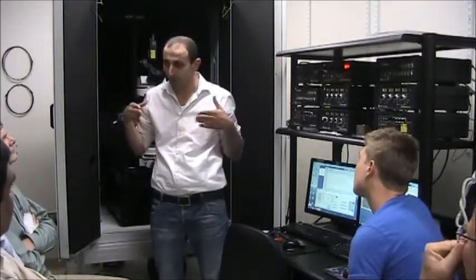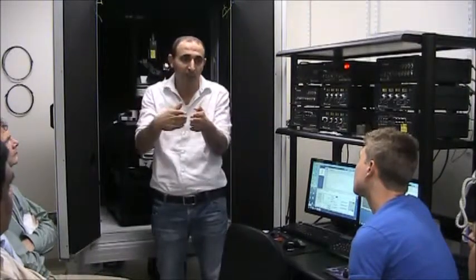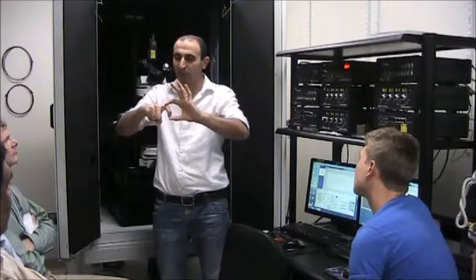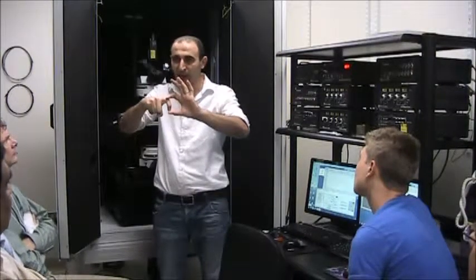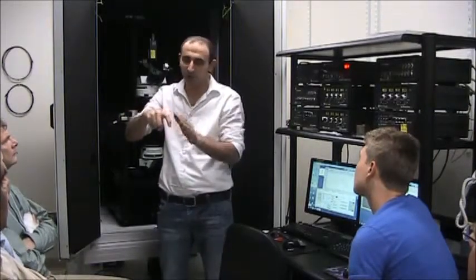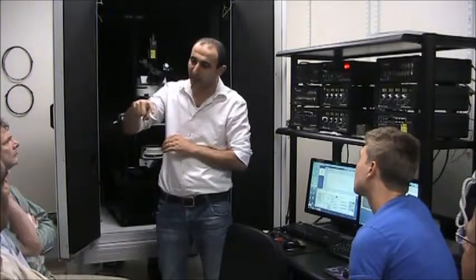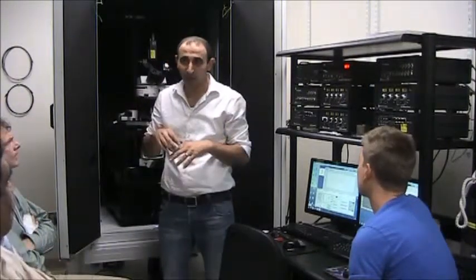It's made of glass, pulled under heat to form a very sharp end, and then it's bent. The bend gives about a few tens of microns between the cantilever and the end of the tip. So when you are focused with a 50x objective on the tip, you don't see any obscuration due to the cantilever. Also the bent angle lets the tip be exposed, so you can easily see the tip touching the surface from the top.